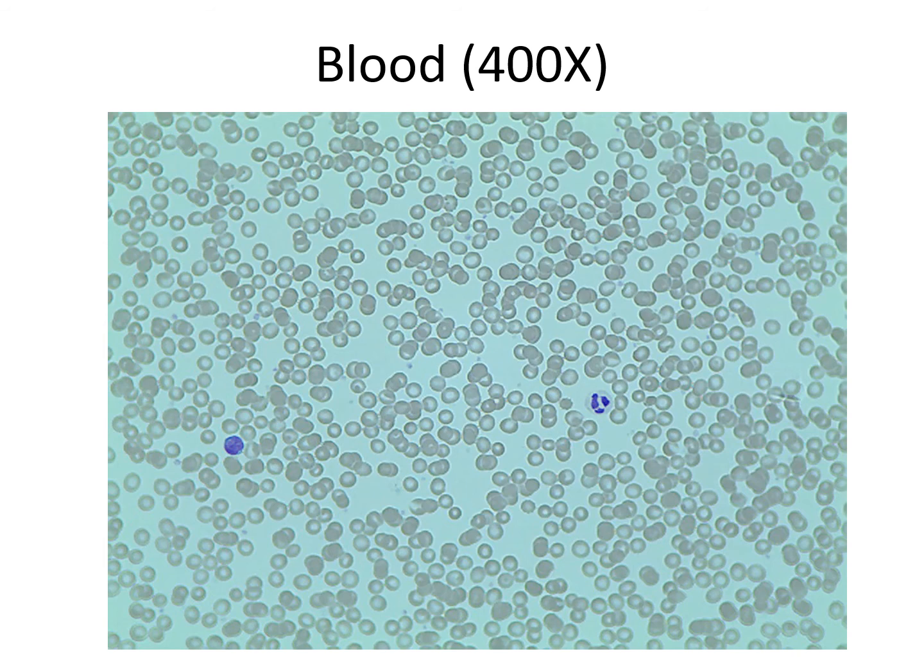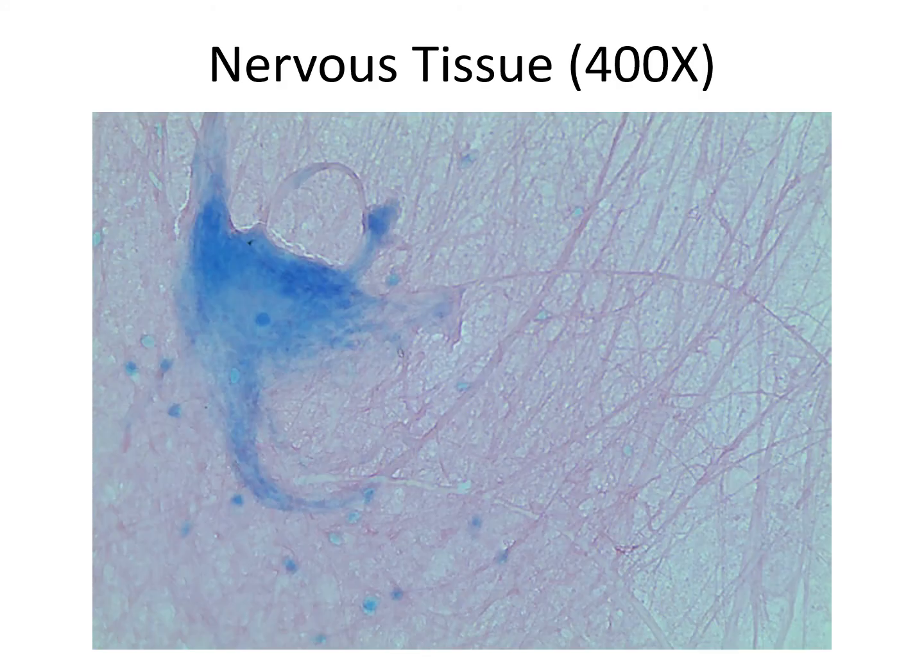That's blood, connective tissue as well. It's a fluid connective tissue, and those are small cells, many of them. Those are erythrocytes or red blood cells. The bigger ones, like this, are white blood cells. Let's see if we have any platelets. I do, right here. I don't know if you can see it or not, but these little dots here are platelets. And here's another one right there. And what is in between the cells? That's plasma. So blood is a fluid connective tissue with erythrocytes, leukocytes, platelets, and plasma.